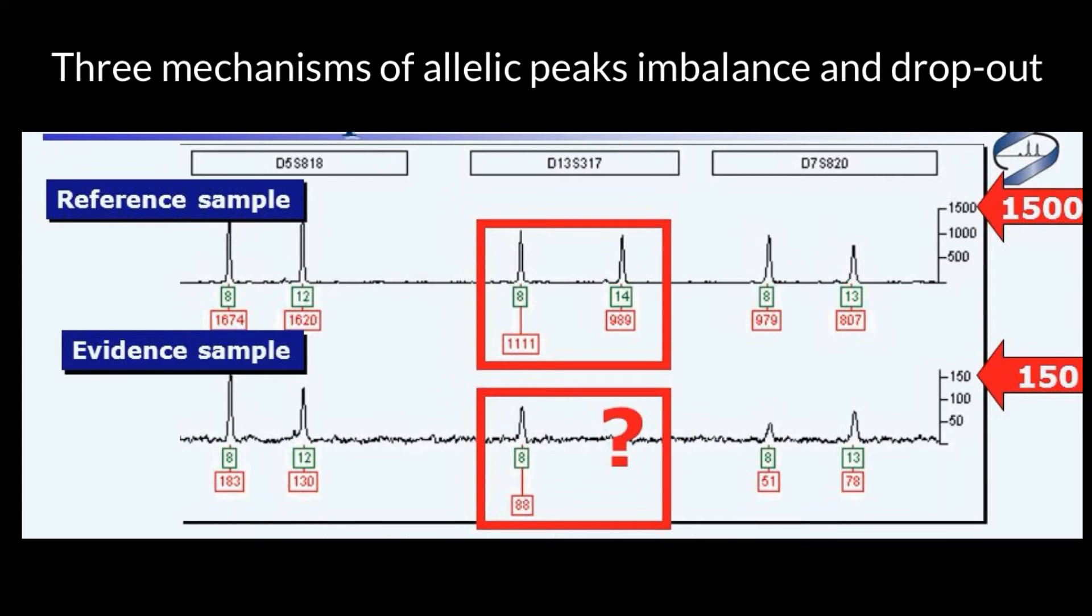But for this locus we have 8 repeats here, 14 repeats here, but only 8 repeats here. And it looks like this person who gave this sample or evidence sample that have been collected at the crime scene is homozygous at this locus. And it has also the same calls for the locus which is D7S820.